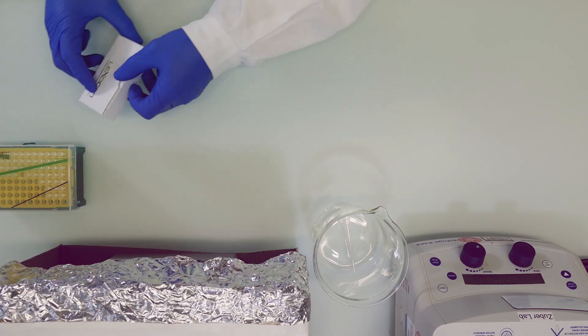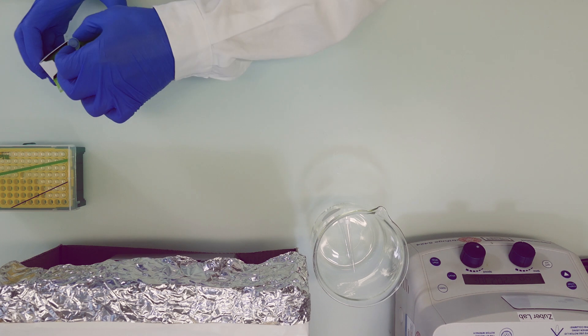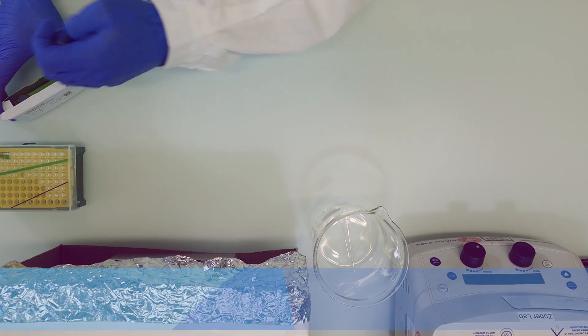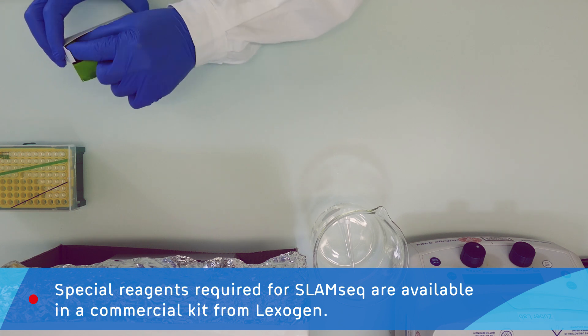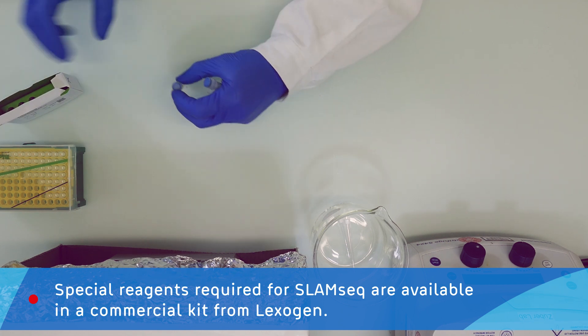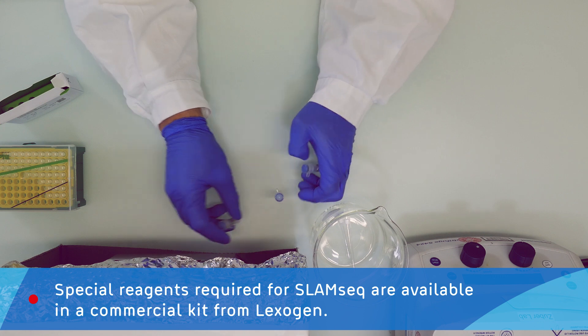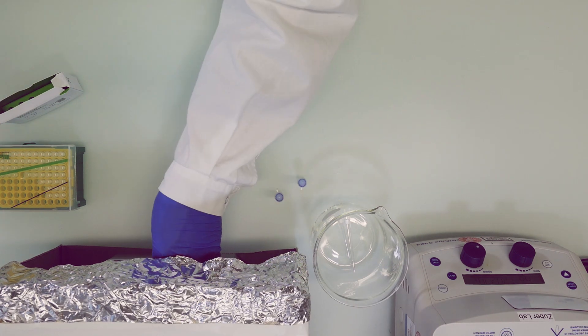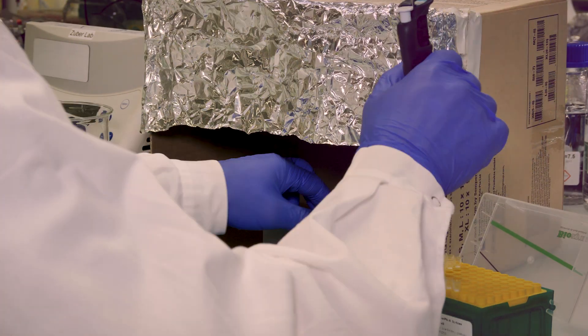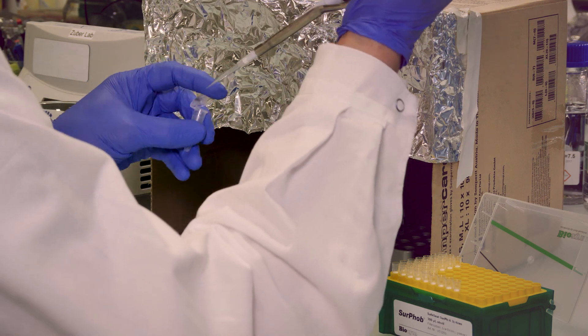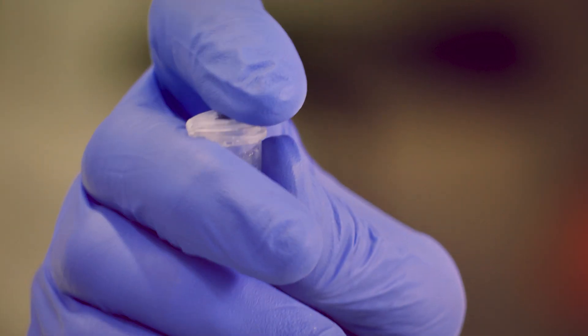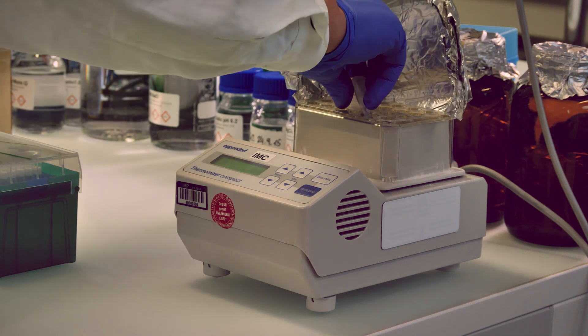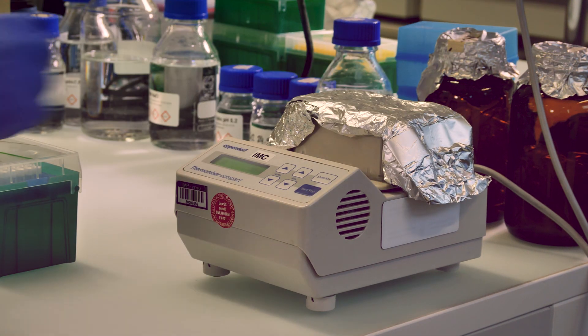Now that we extracted the RNA, we can continue with the alkylation process. We simply mix a master mix of iodoacetamide for alkylation and an appropriate buffer. It has to be noted that also the iodoacetamide is photosensitive, so at this point we still work light protected. Then we add our master mix to roughly 5 micrograms of each sample and incubate it on the heat block at 50 degrees for 15 minutes.